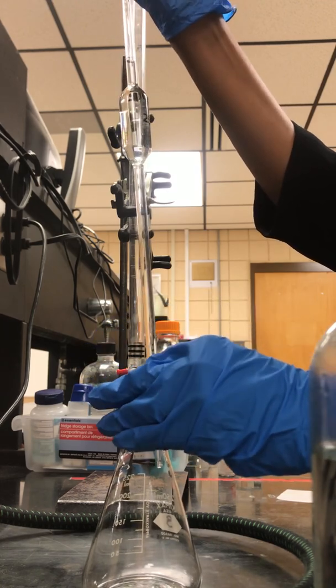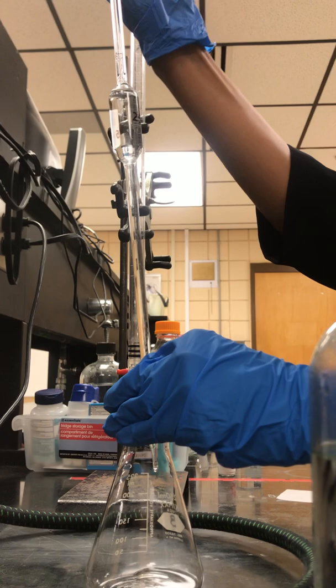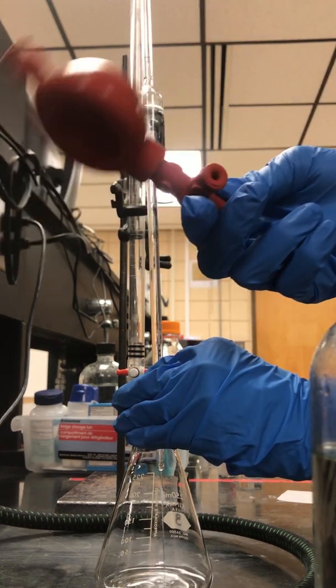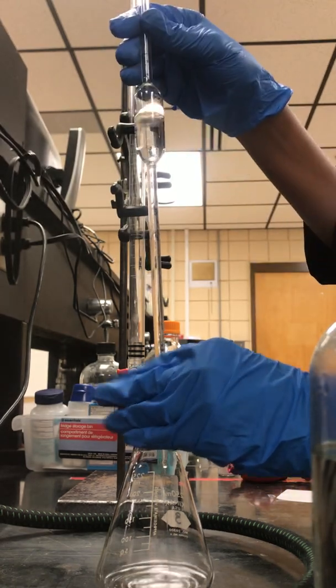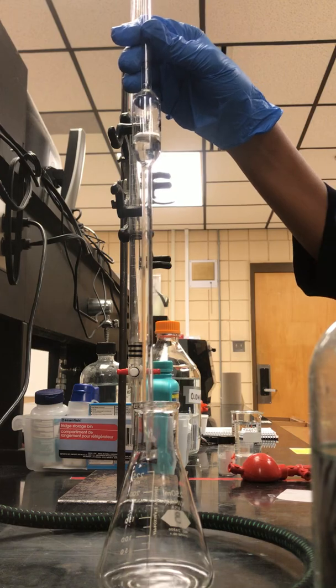You can either press the E to get it to come out or you can remove the bulb from the pipette and it'll just go out via gravity.